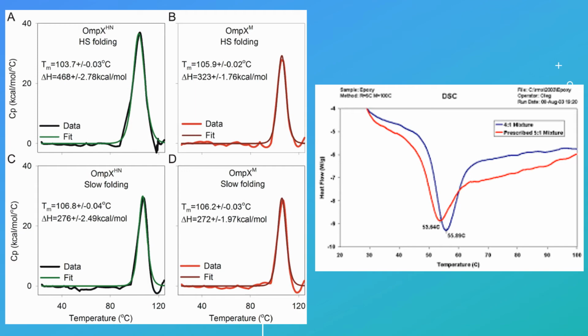Glass transitions may occur as the temperature of an amorphous solid is increased. These transitions appear as a step in the baseline of the recorded DSC signal.